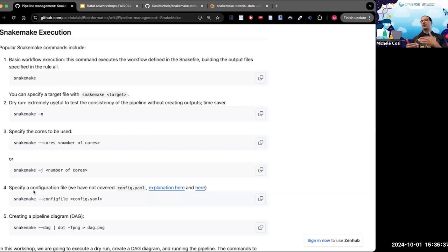Snakemake's dry run only checks that this outputs that. Rule 1 can be followed up with rule 2 and can be followed up with rule 3. So Snakemake dry run is one of, exactly, Eric, that's huge. I love Snakemake dry run. Snakemake can create pictures, can make dry runs. Wow, what is this? Fantastic.